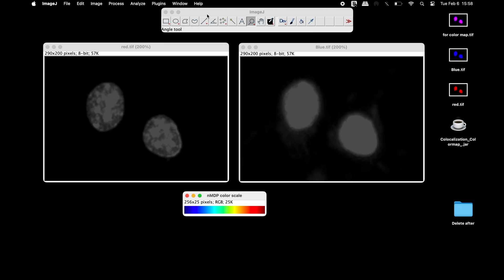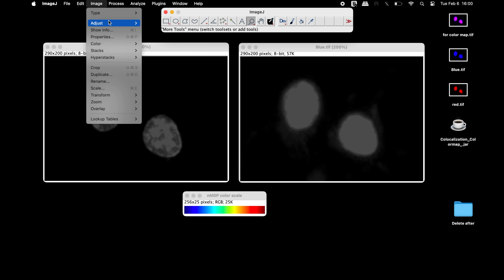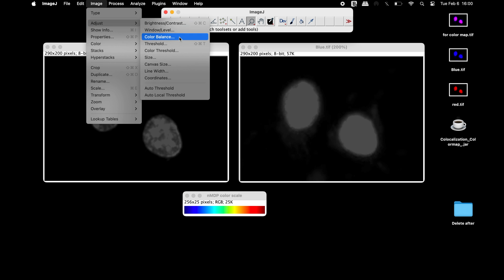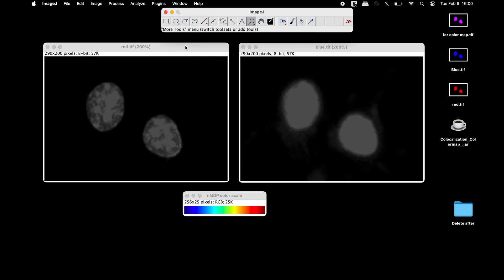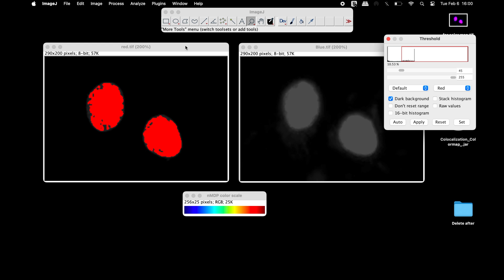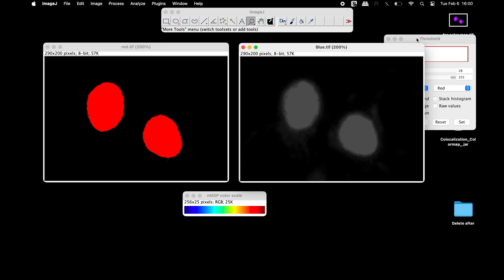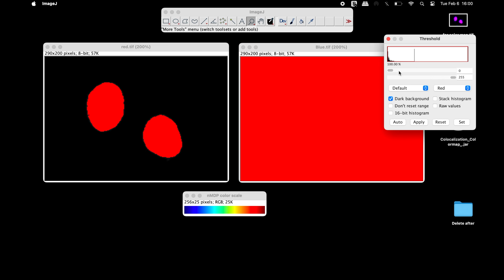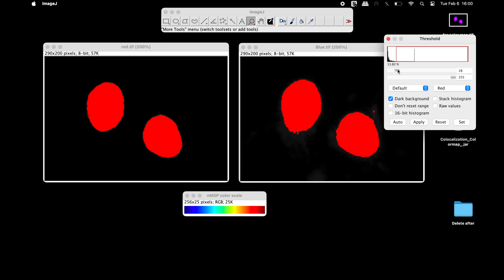Users can also set the threshold manually. To set the threshold, select the 8-bit image and threshold. Note the threshold value from the upper slider. Similarly, find the threshold value of the other image.